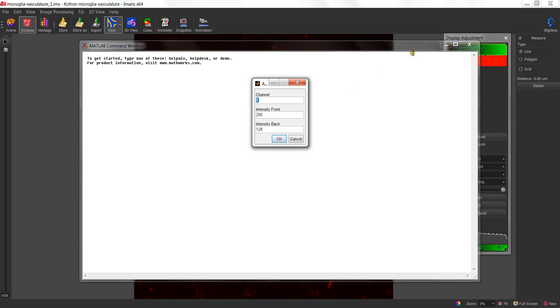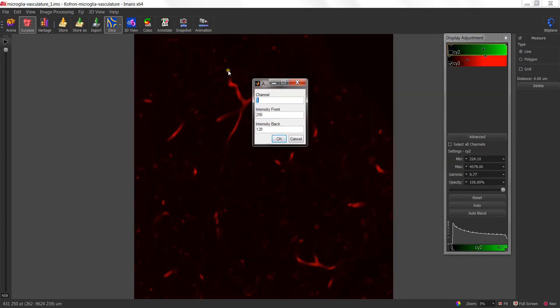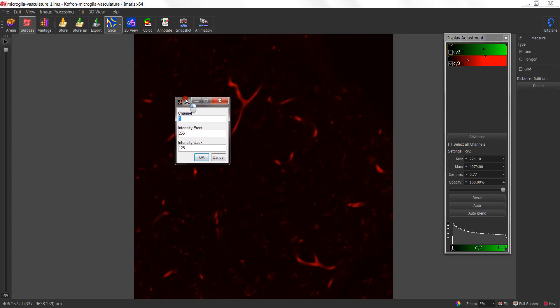In the dialog, it asks for three values or three pieces of information. The first being the channel that you would like to apply the attenuation correction to. In this case, we want to apply it to channel 2, which is our Psi-3 channel.